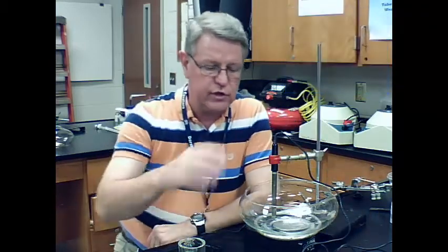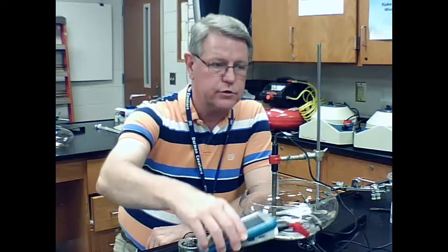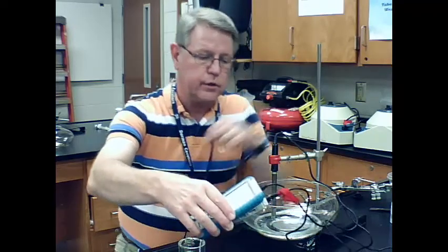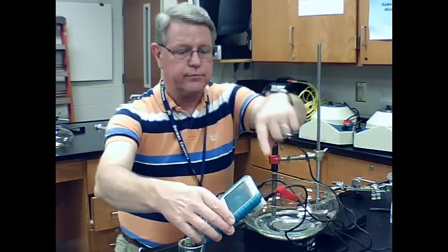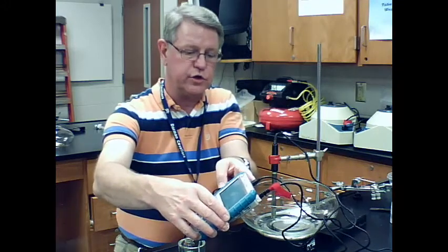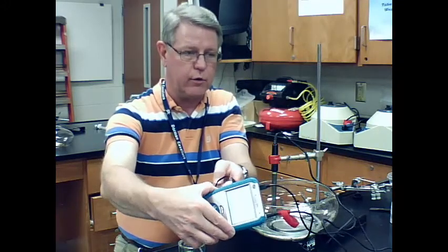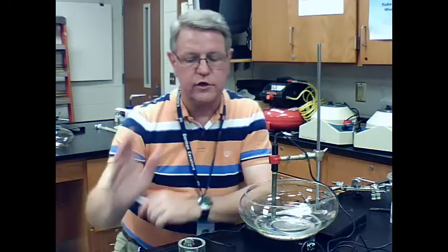So once everything's hooked up, we're going to hook up the pH probe to the Vernier LabQuest. It goes in the top here. We're going to connect to the computer using a USB cable. We have power hooked up here on this side. And so all of this is being registered in a computer, being recorded in the computer when we use it.